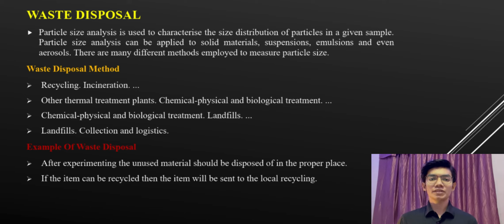Thirdly, chemical, physical, and biological treatments for landfill and landfill collection and logistics. For example, in waste disposal, after experimenting, the unused material should be disposed of in the proper place. Next, if the item can be recycled, the item will be sent to the local recycling.